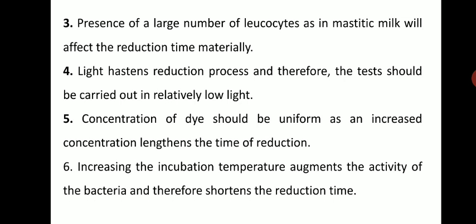Then light hastens the reduction process, and therefore the test should be carried out in relatively low light. So you have to carry out all these procedures in low light intensity.